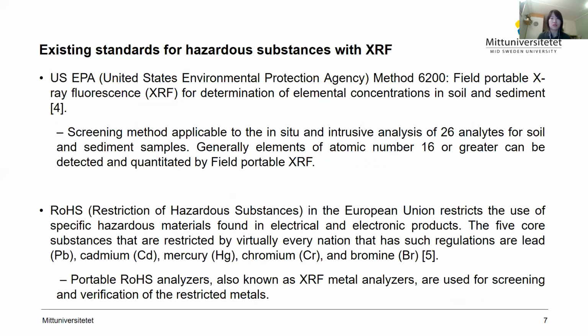In addition to these techniques, X-ray fluorescence is widely used in field applications when screening for high concentrations of metal in the environment in different areas. Handheld XRF technique is already a proven method to detect mercury from electric or electronic products for compliance with the EU Restriction of Hazardous Substances directive.